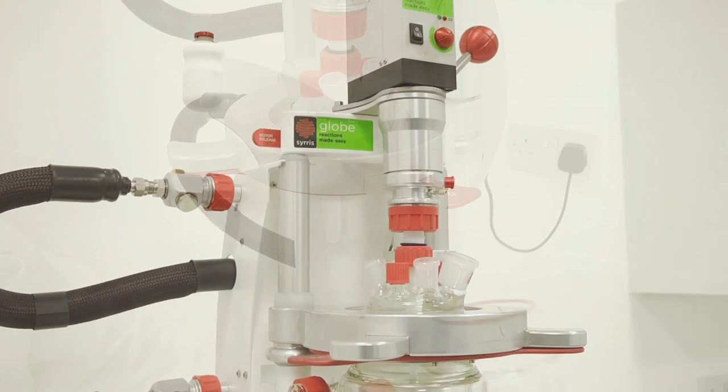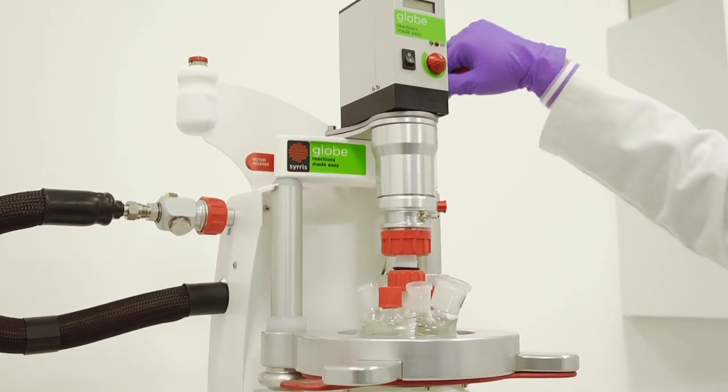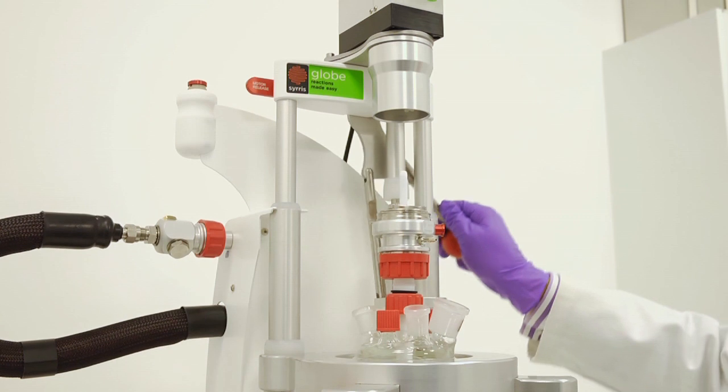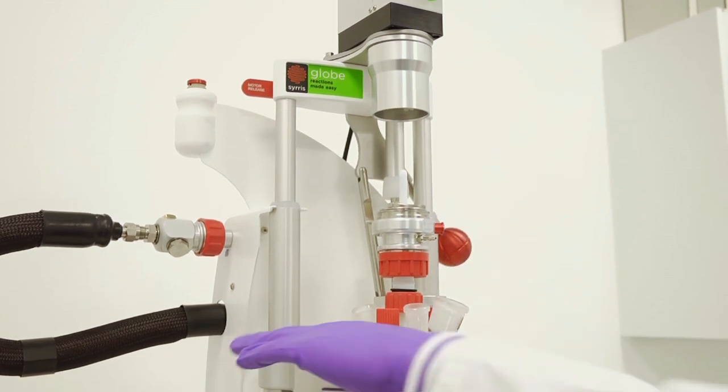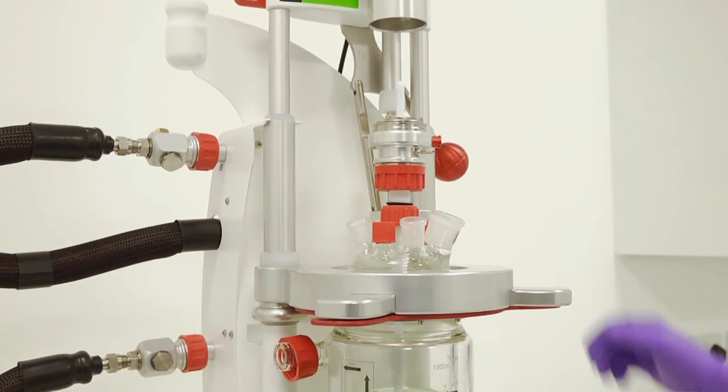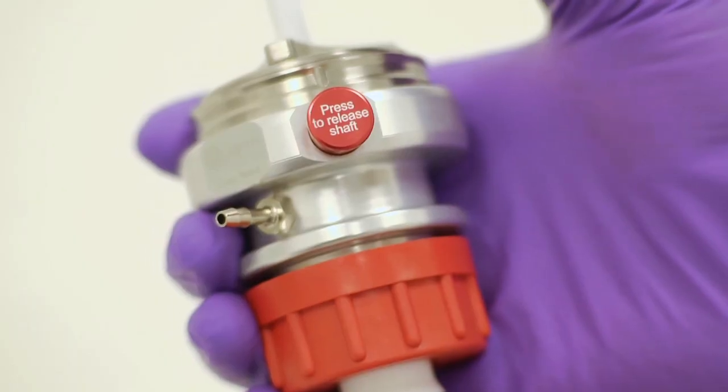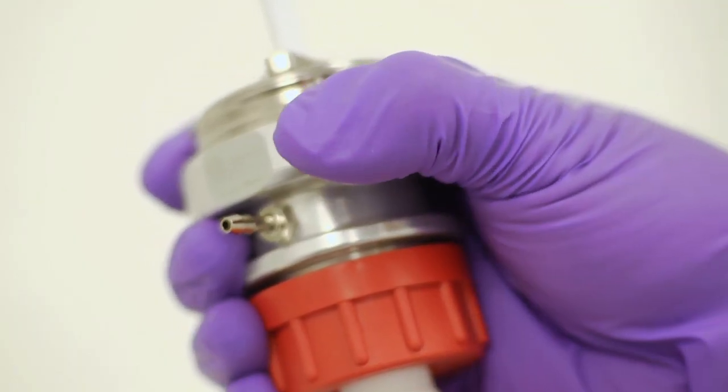GLOBE has an easy to raise motor and auto-aligning stirrer. Pull the GLOBE handle to raise the stirrer motor away from the stirrer seal and guide. A button on the stirrer seal and guide allows instant stirrer height adjustment.